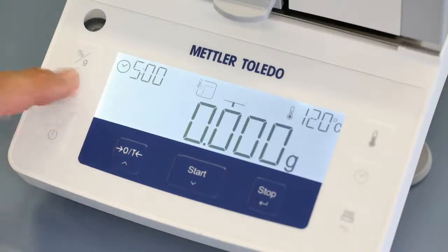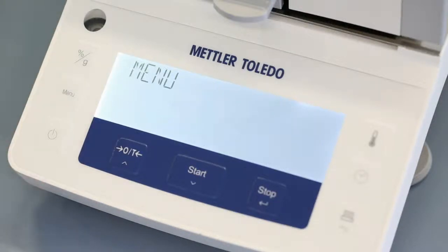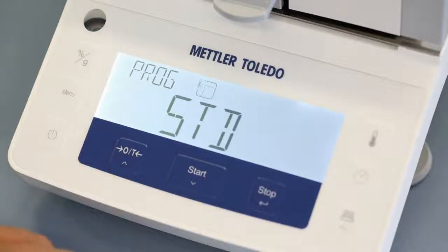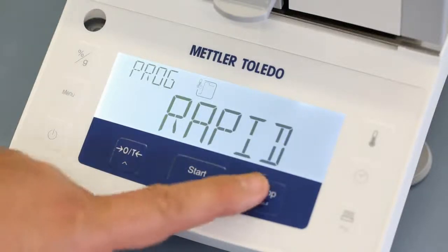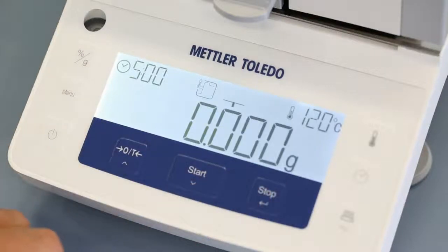Rapid drying overshoots the selected temperature for three minutes, which is ideal to speed up the measurement time for substances which have a very high moisture content.